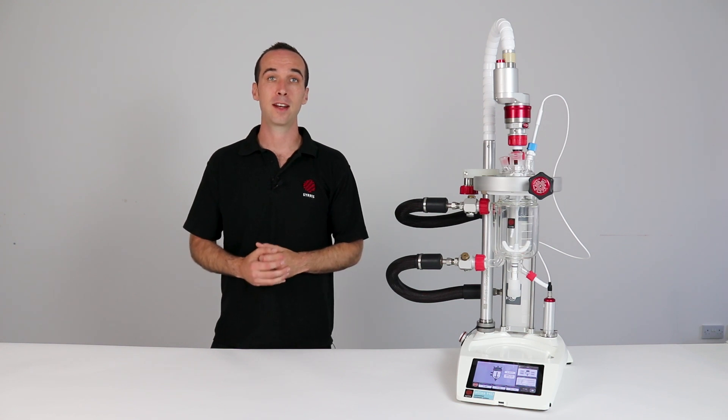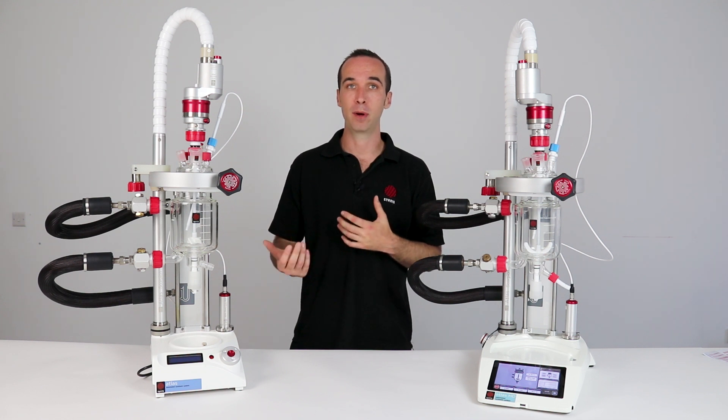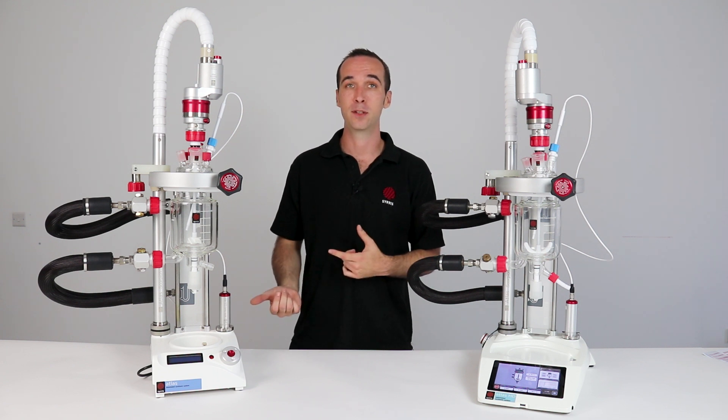Hi, I'm Stephen from Syrris and today I'm going to walk you through why you would consider upgrading your Atlas Classic to our new Atlas HD. Atlas HD builds on the success of our Atlas Reactor platform with all Atlas components compatible with the Atlas HD, making upgrading to Atlas HD as simple as swapping out your existing Atlas base.